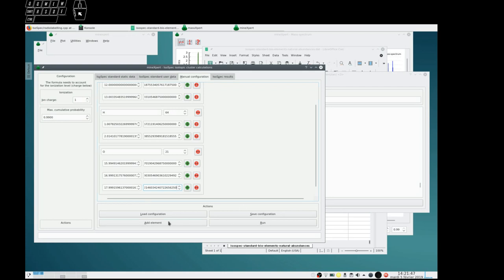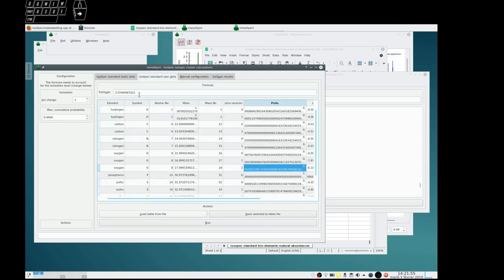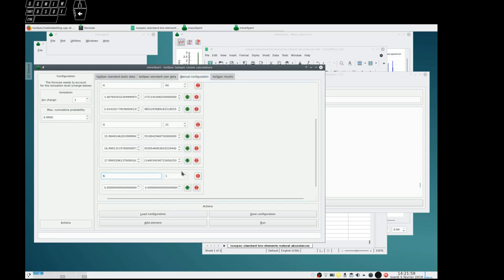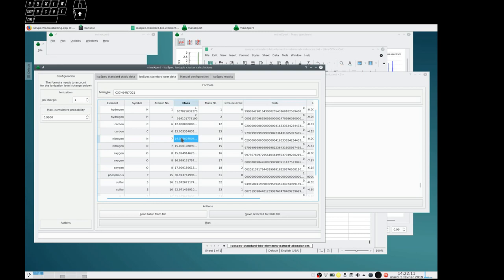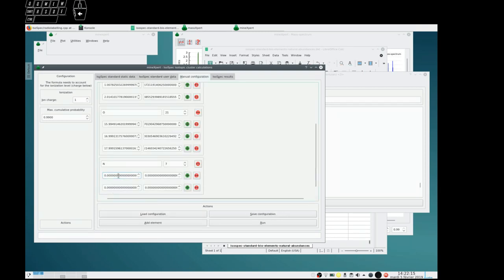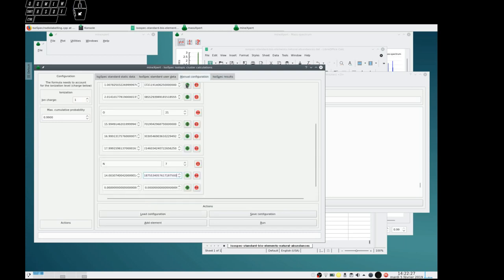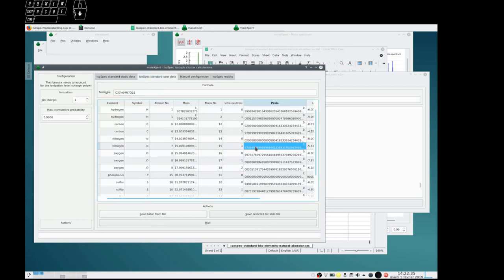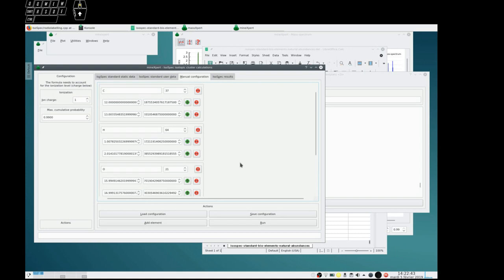And finally, we have to add a new element that's going to be the nitrogen. How many nitrogen atoms do we have here? We have 7, right? So let's put this here. And we know we have 2 isotopes. The first here, let's start with the lightest isotope. Okay. Then the heavier isotope. There. And finally, the abundance of that isotope.